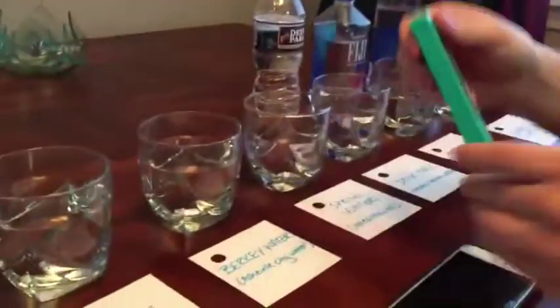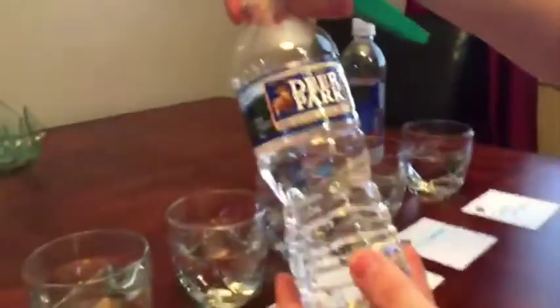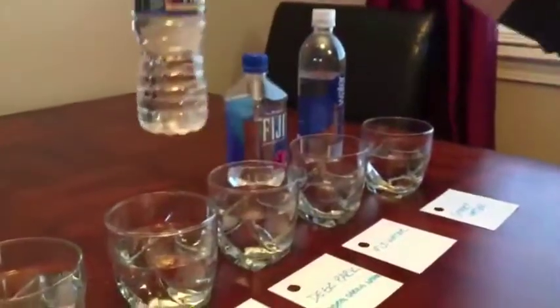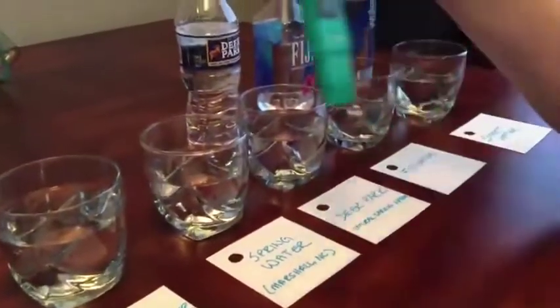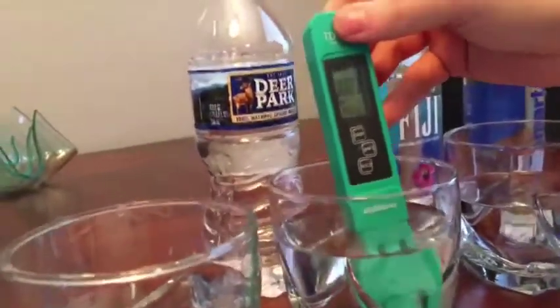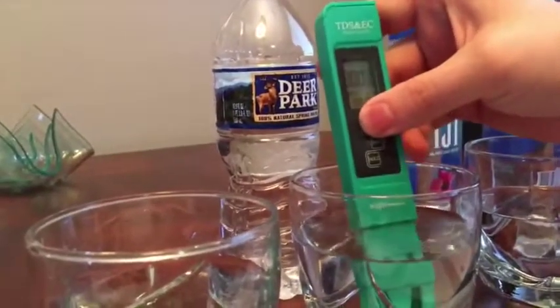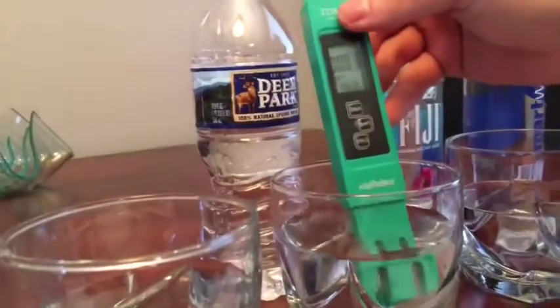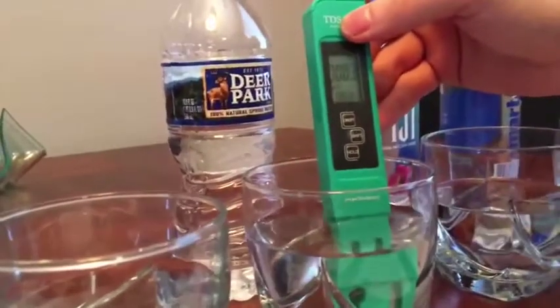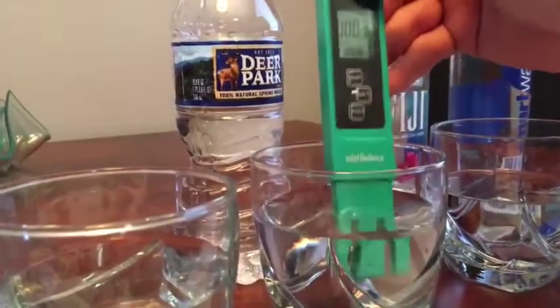So this tool is very essential for many different industries. Here is Deer Park water, 100% natural spring water. We just want to show you a comparison. We got a 0 reading right here. I start. If you look at that, the Marshall, North Carolina water was 2 parts per million. This is 3 parts per million. It turned off on us, it has an automatic turn off feature. That's nice. Deer Park uses a true natural spring water, and this does not have a lot of additives in it.